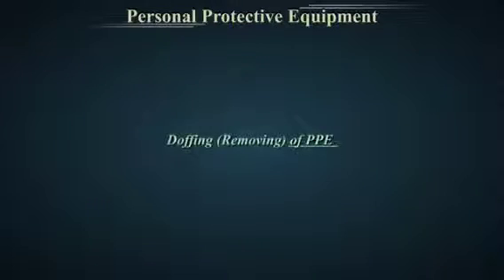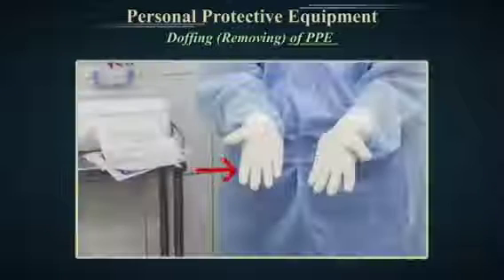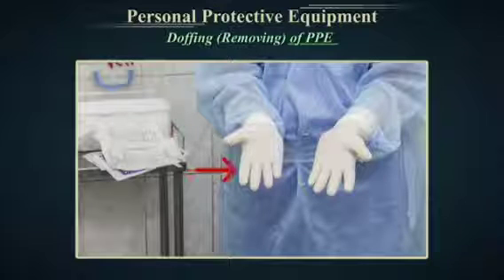Doffing or removing of personal protective equipments. All movements in doffing should be done in a slow and intentional manner. This is to prevent aerosolizing any pathogens released while doffing the PPE. The first step is doffing the gloves.